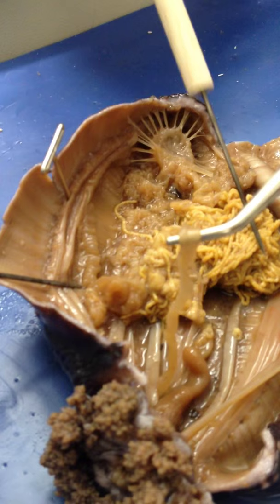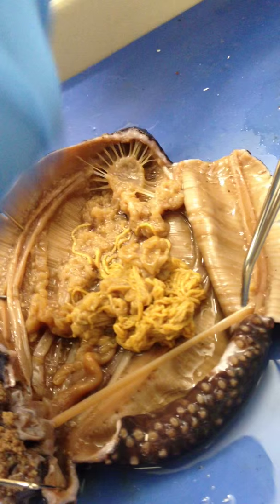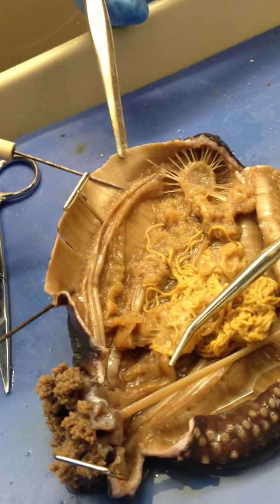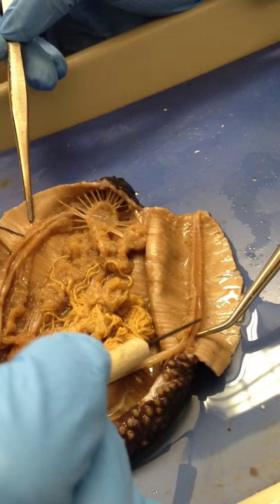Where's the ampulla? I don't know how to pronounce it. It's got to be here, or along here. There are little things that stick out. Is it the same purpose as the ampulla in the starfish? Yeah. I guess they're right along here. So it's all those little blobby thingies right here — the little blobby things.